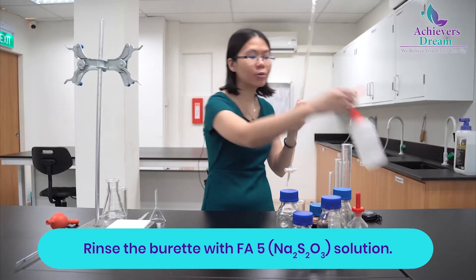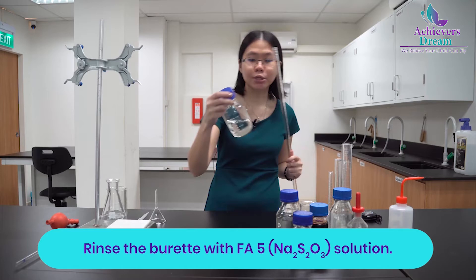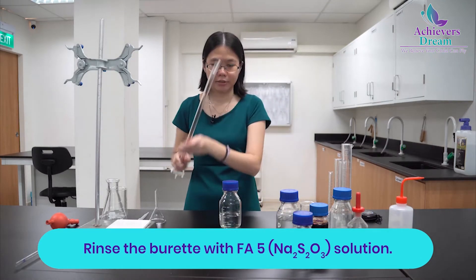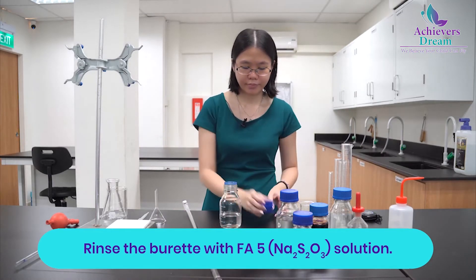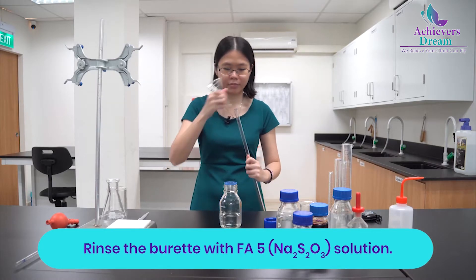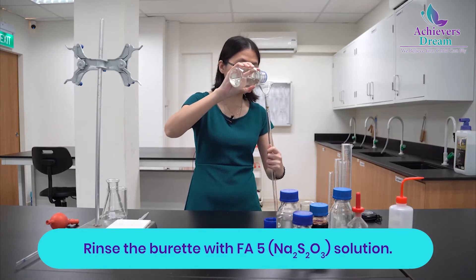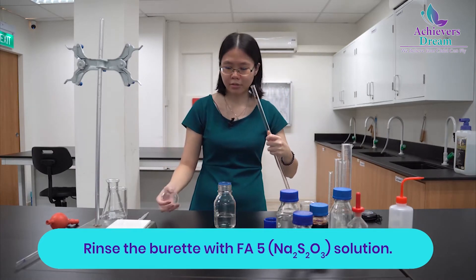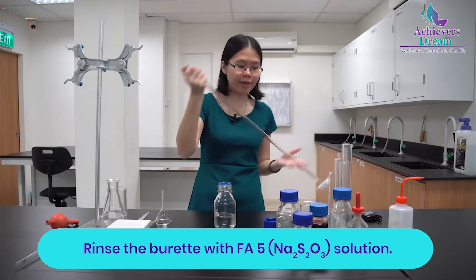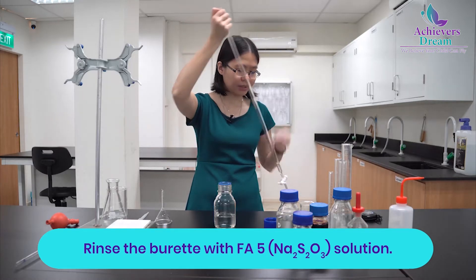For your next step, you are going to rinse the burette with the solution that you are going to fill it with, so you will rinse it with FA5 which is your sodium thiosulfate. Fill the burette with a bit of your solution, then cap the burette and gently rock it from side to side. Then drain the solution into your waste beaker.